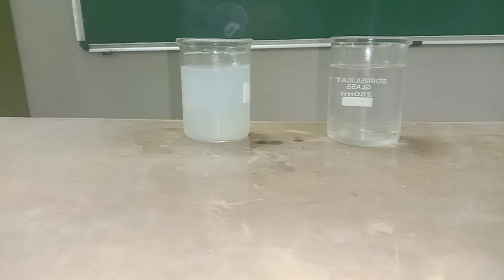So, what is the reaction? The sodium metal is very reactive. When it reacts with the water, it forms sodium hydroxide with the liberation of hydrogen gas. And the flame is produced due to the formation of hydrogen gas. This is an exothermic reaction. It produces more heat. Due to that heat, the hydrogen gas will form a flame, and it will catch fire also. If the amount of sodium metal is more, it catches fire.